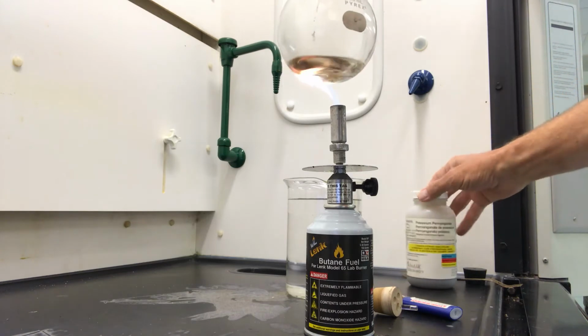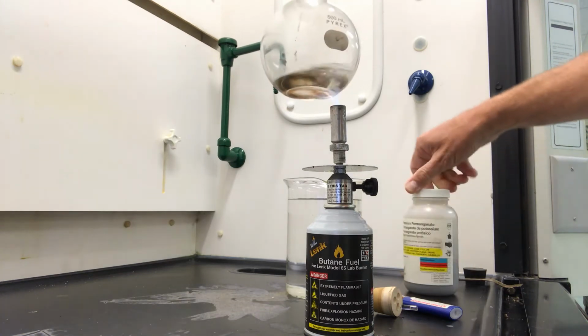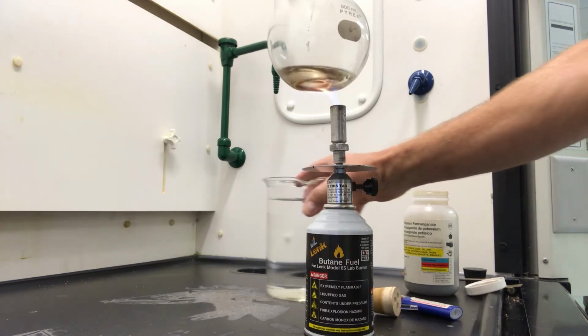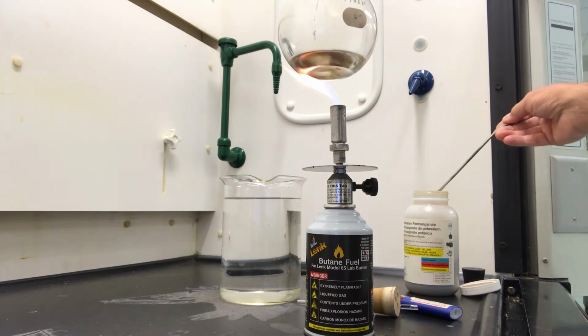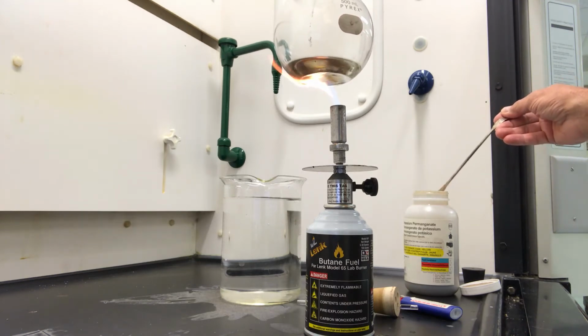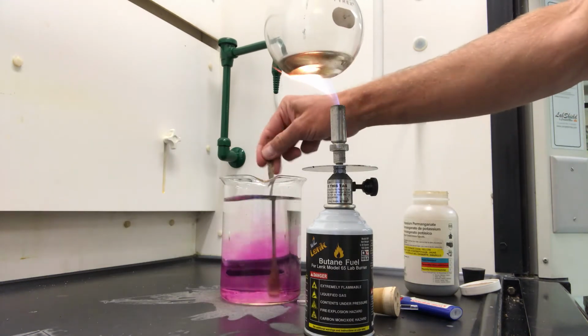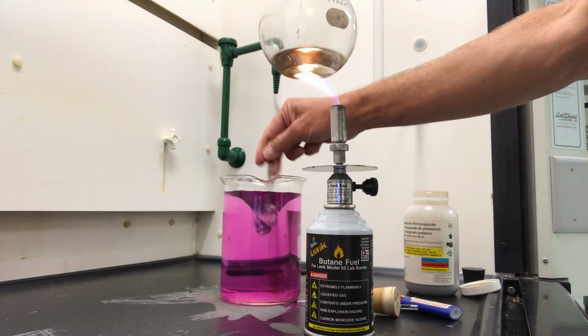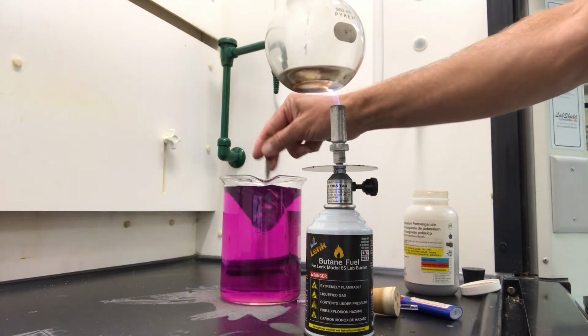While that's working, I've got to multitask here. I've got a jar of water over here, and I'm going to put some potassium permanganate in there just to give it a nice color. This experiment is called the fountain experiment. And you'll see why.